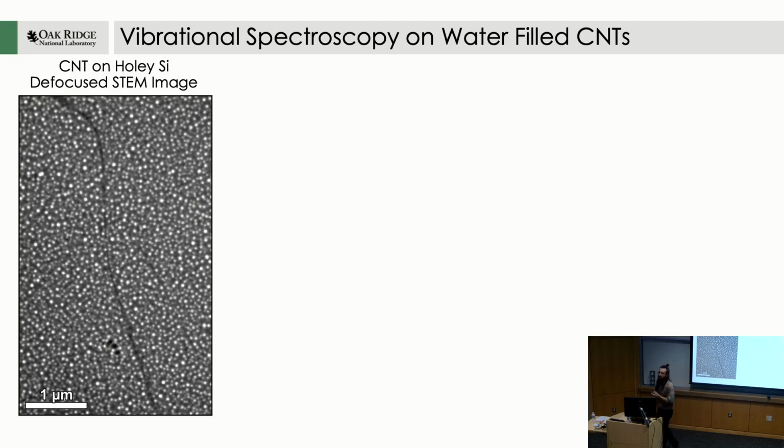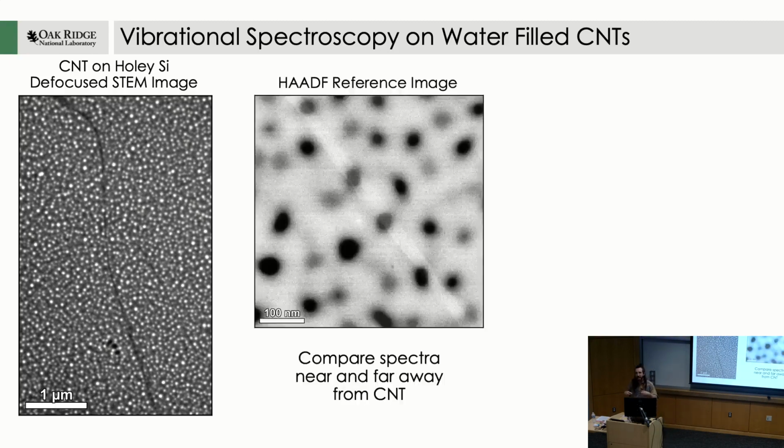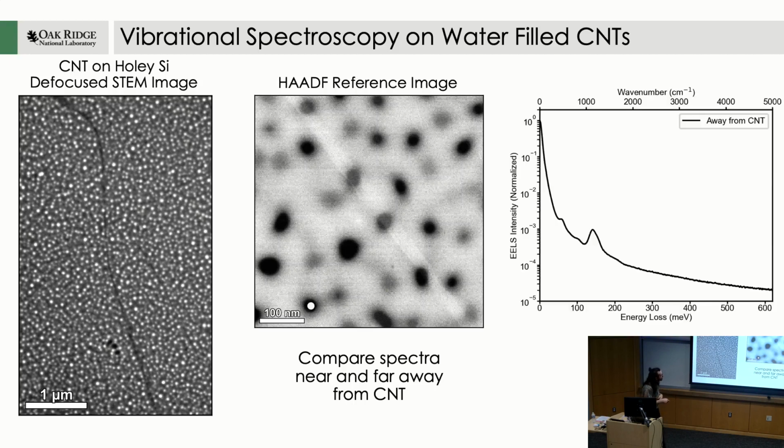But now we want to look at some CNTs. The first sample I'm going to look at is carbon nanotubes, which you can see tracing through this sample. It's just on a silicon grid with a bunch of very small holes. We can go into a STEM imaging mode, and you can see it not super easily, but definitely nicely enough to make sure you know what you're looking at. And we can see the tube extending through this area right here. So we can put our beam in this hole right here, and we can see a spectrum.